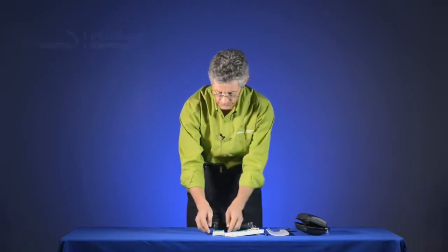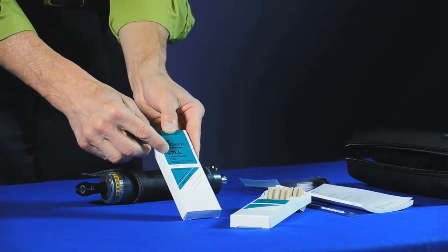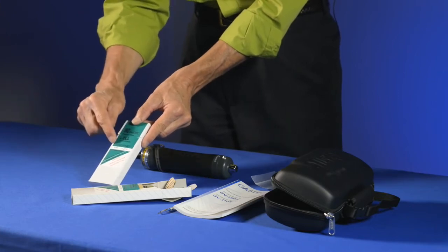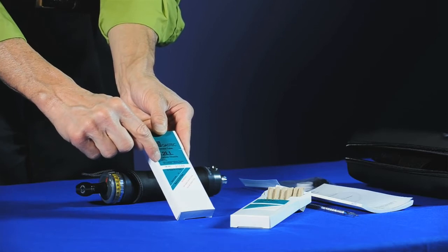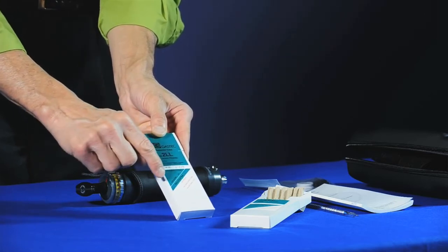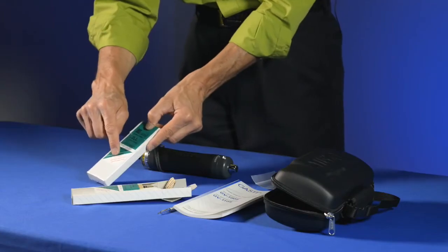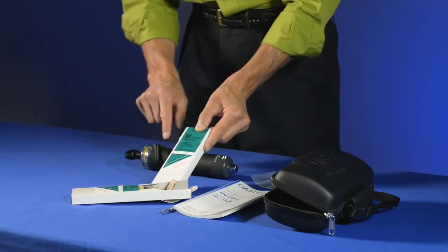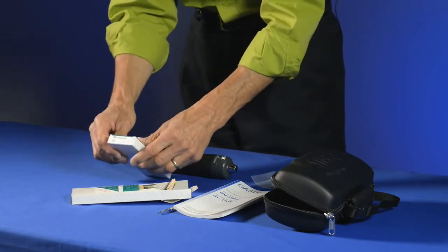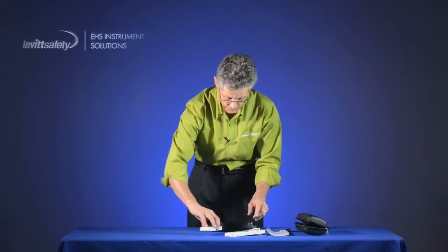The other part of the system is the boxes of tubes — over 500 different ones are available. Today we're using carbon dioxide, a number 2LL tube. On the front of the box it shows the range of the tubes and the gas being measured, storage instructions, that there are 10 tubes for 10 tests per box, and a warning that the tubes are pre-calibrated for use only with the GAS-TEC pump. On the top of the box you'll see the valid-until date, which is important to check.